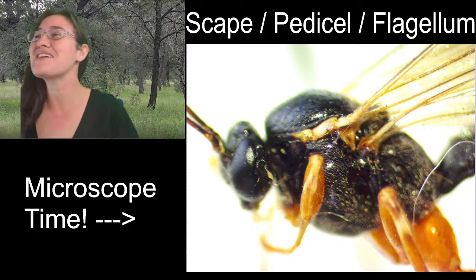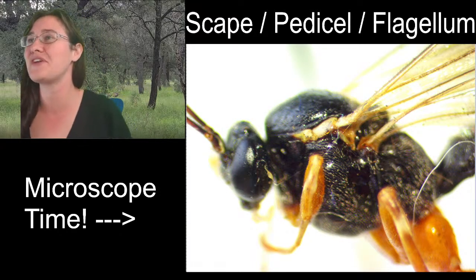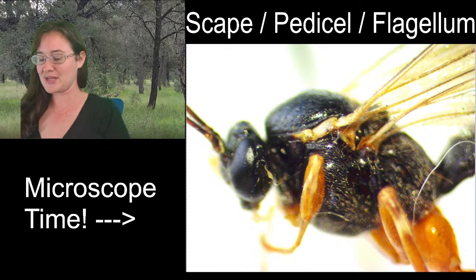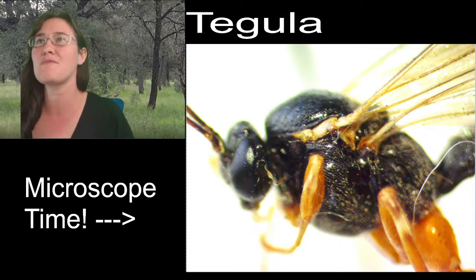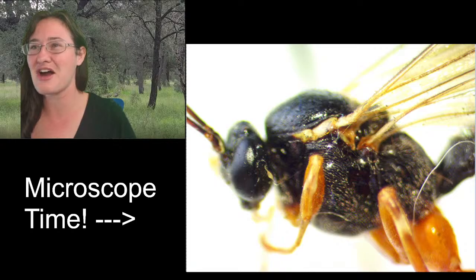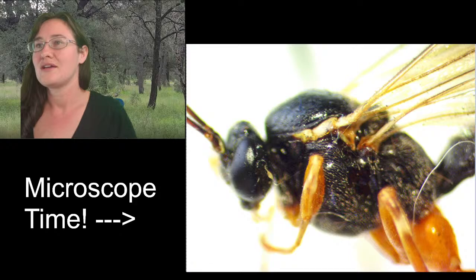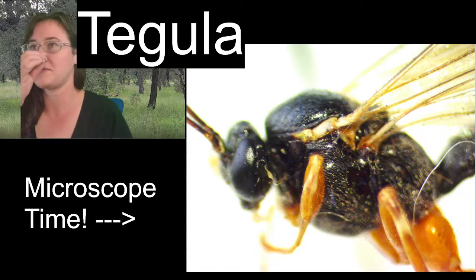Fair. So we are looking at the lateral of our thoracic region here, and there are a couple of characteristics that I kind of want to start by pointing out. We can see the thing that we call the tegula. Sorry, I'm going to fix these words. I don't like when they do that. They autofill to the size of the box. Sometimes it decides to change its format just like that. It drives me up a wall. There we go.